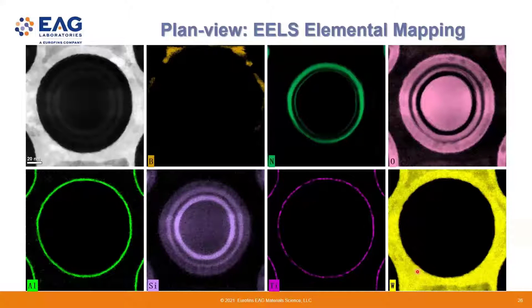For example, with the new Continuum, during the dual EELS mode, you can comfortably cover about 5,000 to 6,000 eV of range. You can do a lot of stuff with this wide range of energy window.